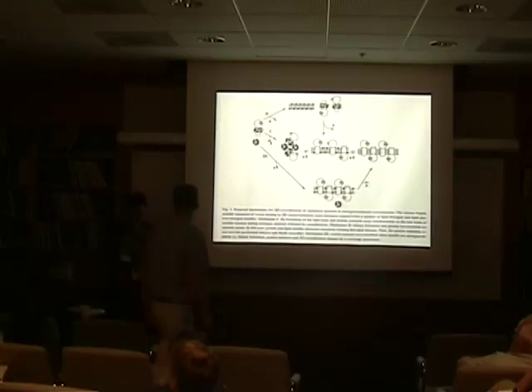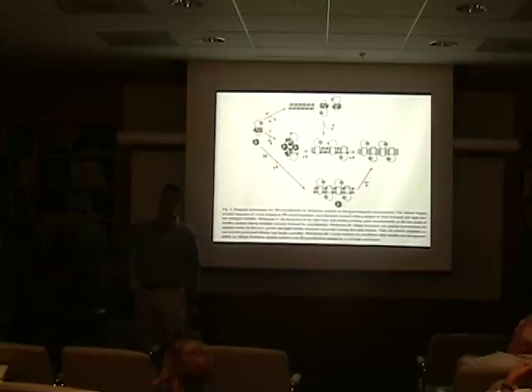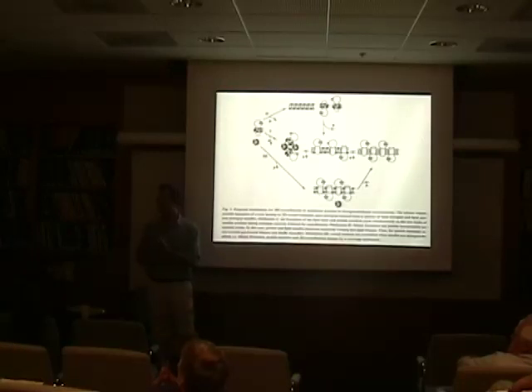Right, so I'd like to now open this up for discussion. What Michael has done is, just before this session, we met up, and Thomas, Daniel and Michael put their ideas together into one table as to what factors might be useful for screening. I would suggest that we focus on the initial screen, where we try to identify where there might be a possibility of getting crystals. So the first stage of your four-stage process. I think the main problem is trying to identify roughly where you get your crystals, which you all agree on.